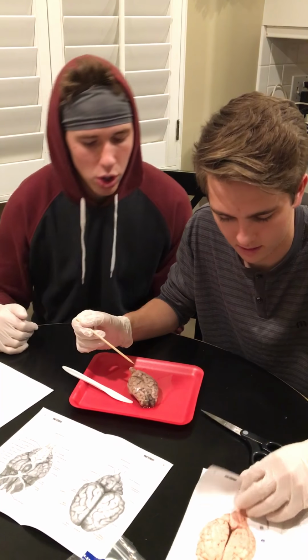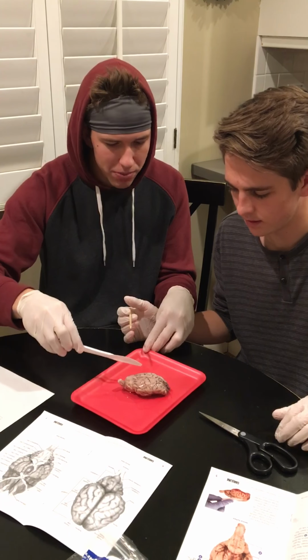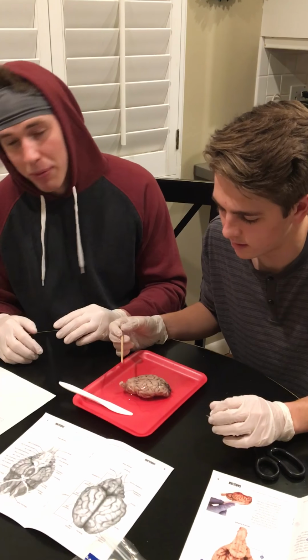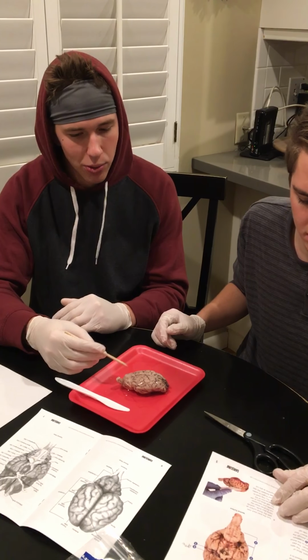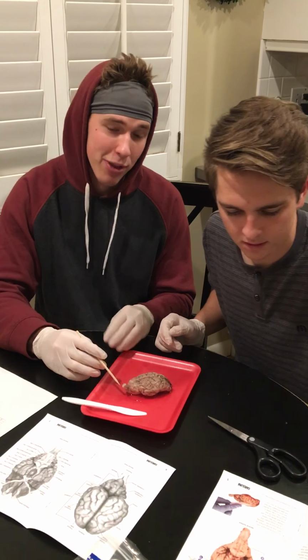The parietal lobe would be next. This is your parietal lobe, right here in the mid-back portion. Your parietal lobe controls your movement. And then the occipital lobe, towards the back of the brain, controls your vision.